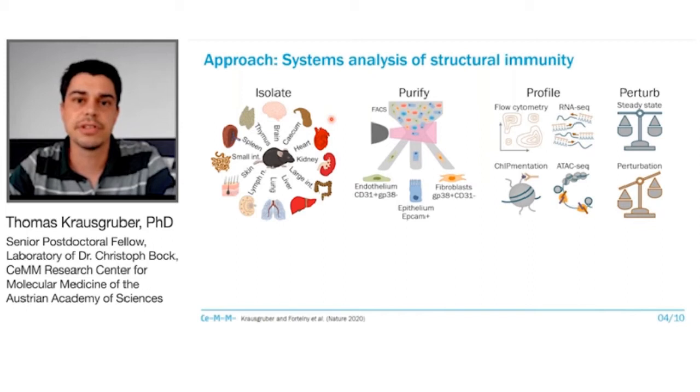And actually, this is very important if you have sequencing as a readout, that you really want to have good, high quality material going into your sequencing, because this greatly enhances the possibility that you will get good, high quality data out. Out of those single cell suspensions of the organs, I used sort purification to sort out endothelial cells, epithelial cells, and fibroblasts. And because I was analyzing my cells in the bulk population, it was still very important to have a good sort purity check.